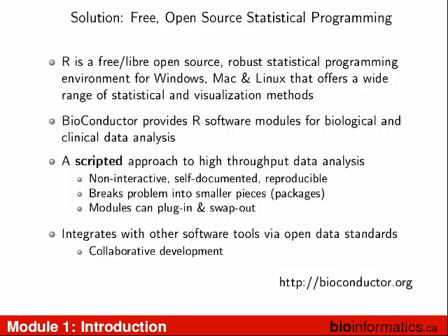The other thing is there's one package, because we're doing such cutting edge stuff here the next few days. There is one package that we're just putting into Bioconductor called Flow Density. It's not quite there yet, and so we couldn't have you go download it and install it in this workshop. So we had to give it to you in this virtual machine. Hopefully nobody had any problems installing it. If we do, we'll get to that. But all the software that we have developed and all the software I've been talking about is in Bioconductor. And through R, you just type in one little line, and it'll basically go and install all that stuff automatically. It's really quite simple to install packages in R.